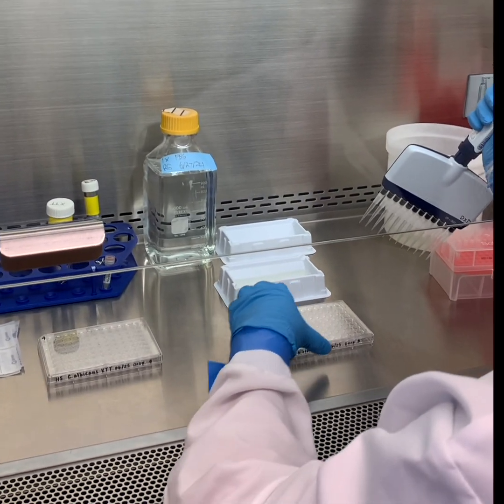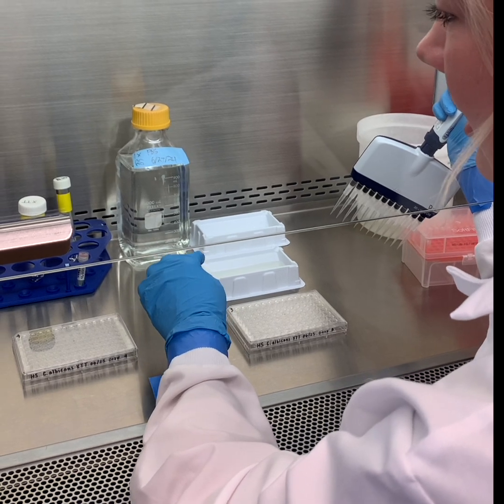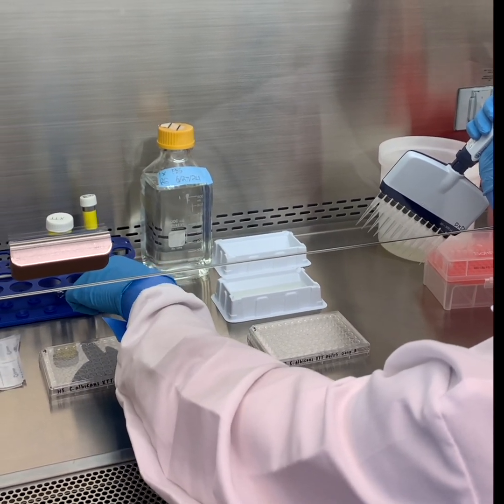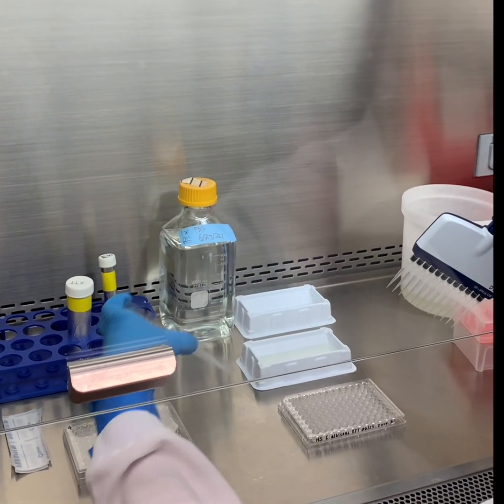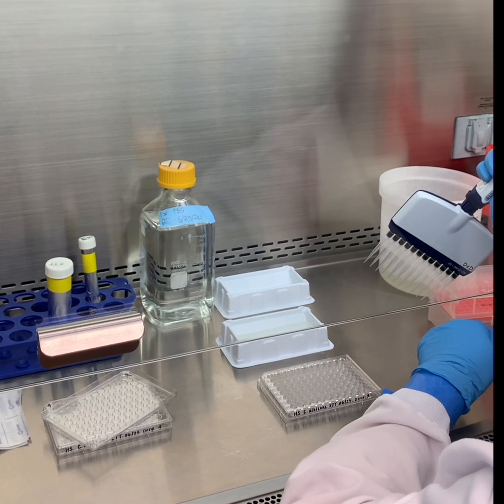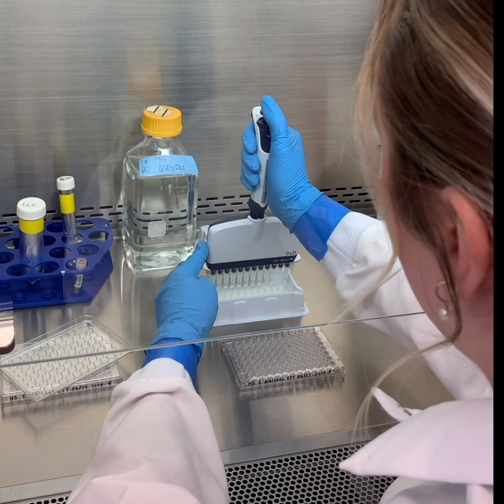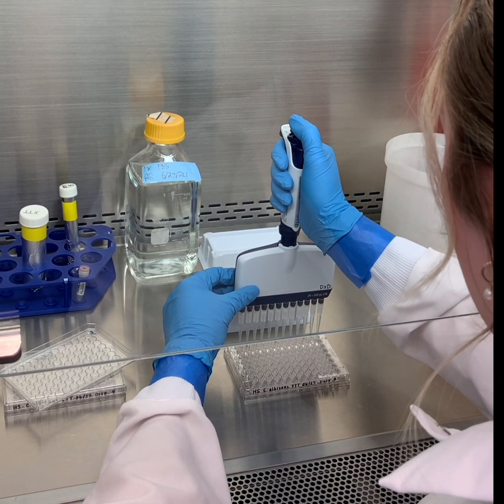Okay. So now that we've washed our plates, we are going to add our XTT menadione solution, which is our colorimetric part of our assay. It is light sensitive, so I just poured it from this tinfoil covered tube into here. So we want to be a little bit expedient about this, but we're going to add it to all 12 of our columns. So we want it in every single one, including our negative control. And we are going to add 100 microliters to all of them.